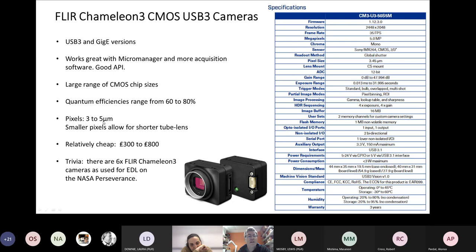The reason for that is that the optical systems are set up for, let's say, a 100 times lens, that would give you nice 100 nanometer pixels at the level of the sample, and that's kind of a sweet spot for sampling. There's not much point in going smaller than that because you're oversampling at that point.